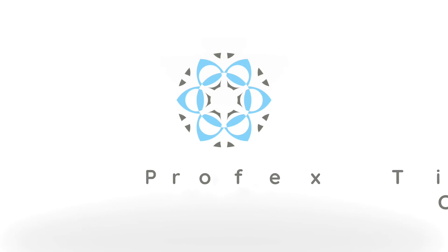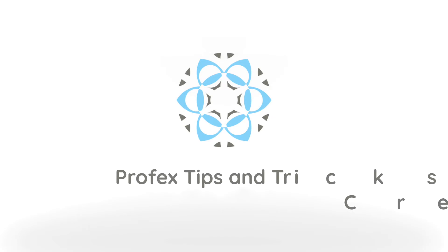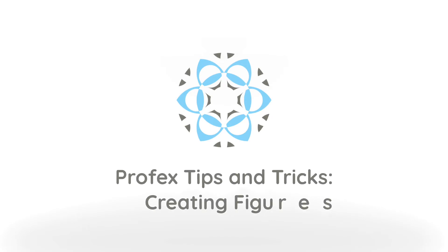Today I'm going to demonstrate some of the graph manipulation features in Profex. We can combine, stack, rescale, and rearrange scans easily. I'm going to give you an overview of these functions which can be used to create publication quality figures.